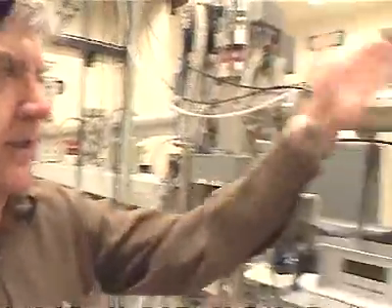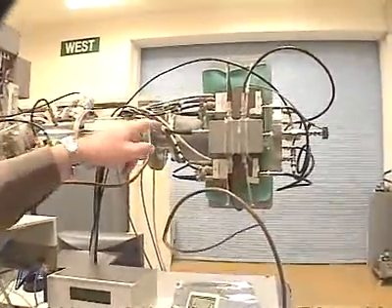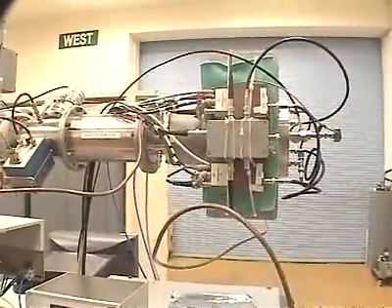Well, if you are a radiocarbon atom, this is the end of the line. The atoms come down into this grey cylinder, which is a detecting device, and that will generate an electric pulse for every atom that comes in. The pulse goes to the computer in the control room, and we calculate on the pulses that come in, and then we know the age of the sample that we've been dating.